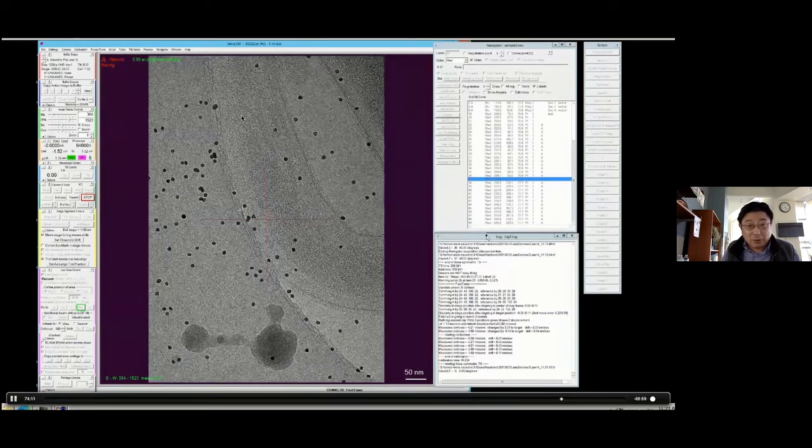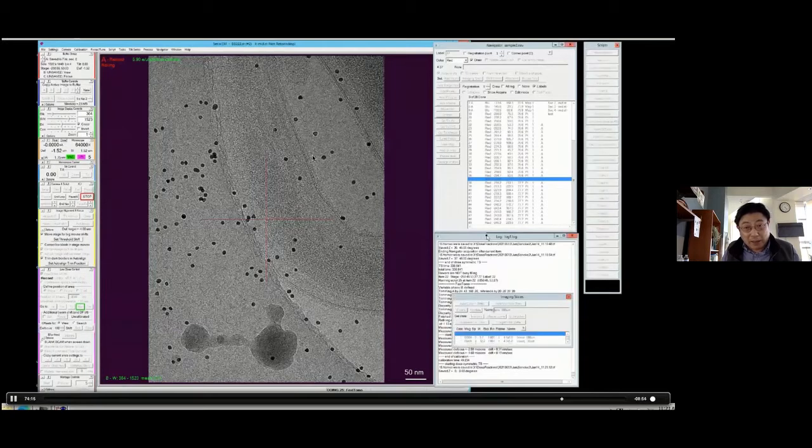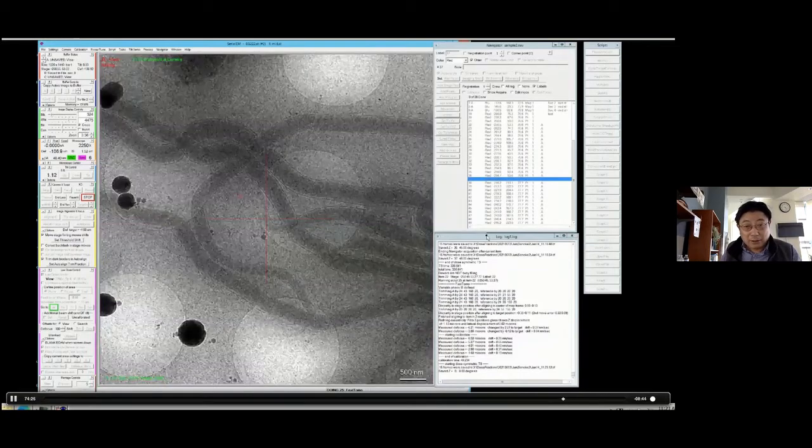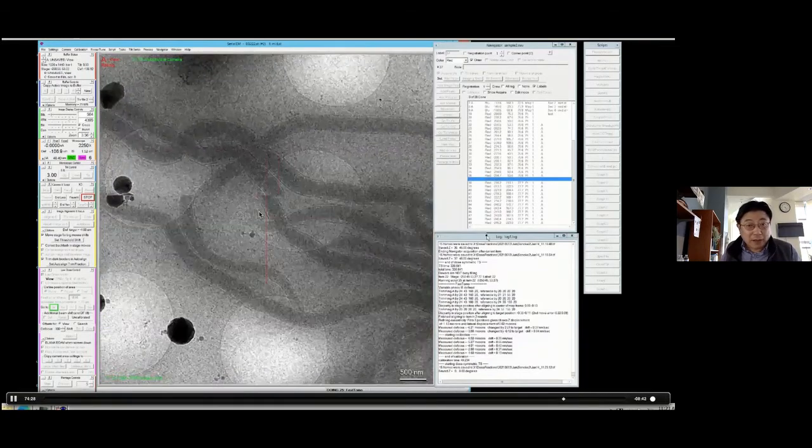See, this is a beautiful cell. You can see the gold concentration, cell shape, bilayer. I think it's nice. You want to get this kind of nice image to help you be sure you're on the right track. And you can find the target.